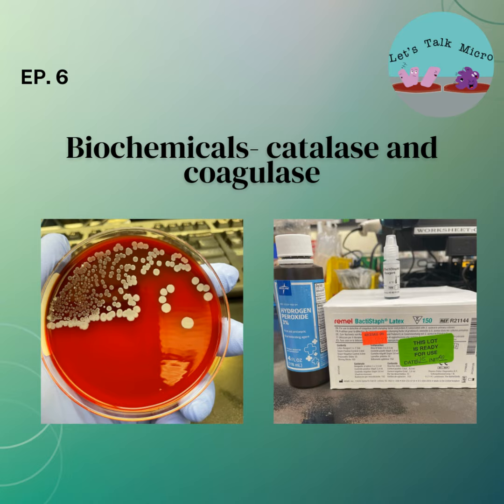So for you students out there, take advantage of all the technology we have. I see students with tablets. Take pictures of your plates. That way, when you're studying, you start seeing those images and you start correlating that image to the organism. Because staph and strep have different morphologies. Your staph tend to be large colonies. They're flat, whereas strep are smaller. They're raised.